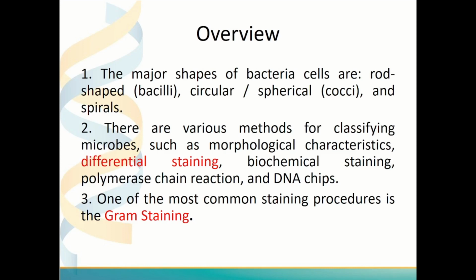There are actually various methods for classifying microbes, such as morphological characteristics, differential staining that we will conduct in this presentation, biochemical staining, polymerase chain reaction, and DNA chips. One of the most common staining procedures is the gram staining.